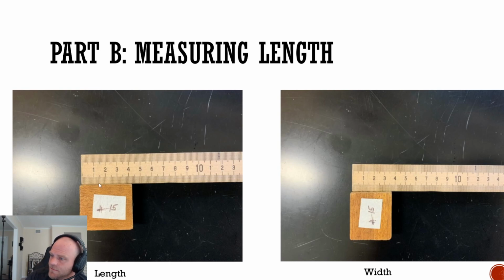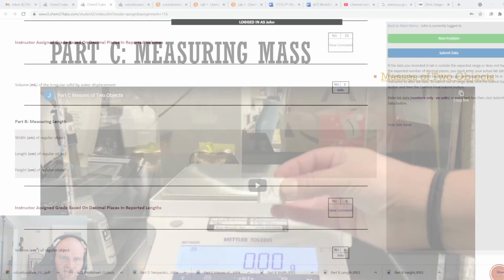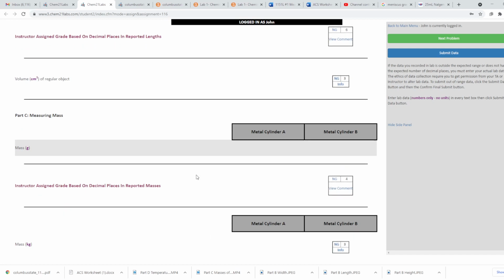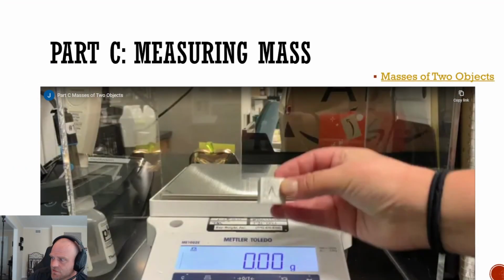Let's keep going. Alright, so for part C, I've included this video. I'm going to watch it with you here. You will be recording, go back to Chem 21, you will be recording the mass of metal cylinder A and metal cylinder B. Okay? So let me go here and let's watch that real quick.